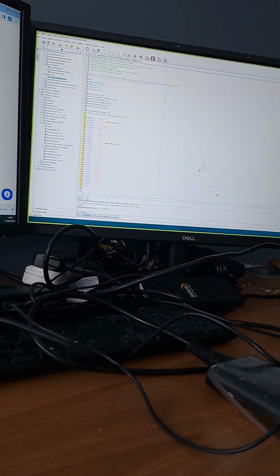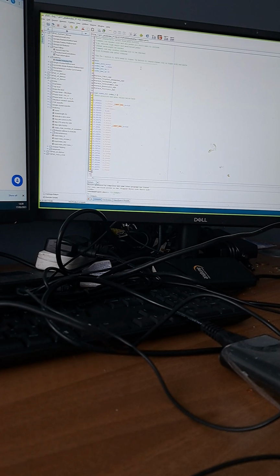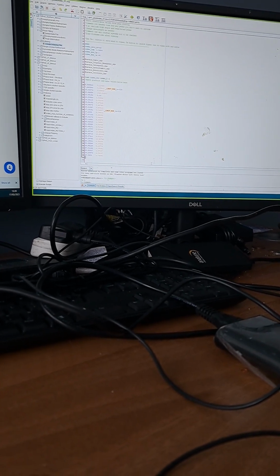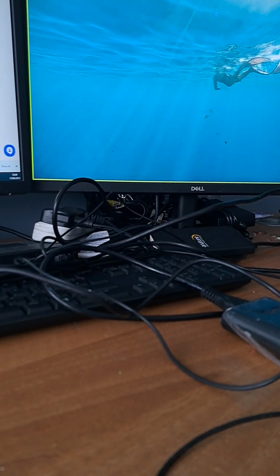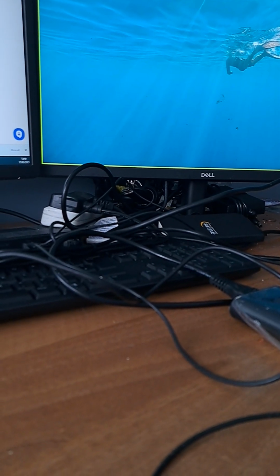And then what you're looking for, you're looking through these six crystal systems. I'm missing one, but it doesn't really matter. In here, between these two brackets and this one down here, we've got our values. Now what we can do is send that on to Topaz. I don't have access to your thing now, so I can't do anything. Okay, so I'm going to give that back to you.